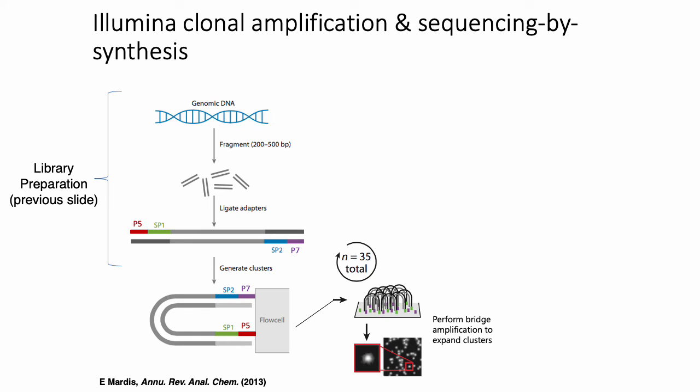And so ultimately the way sequencing happens is that after bridge amplification, you use DNA polymerase to synthesize additional copies of your fragment. And as you're doing this synthesis, you're essentially taking pictures of the bases as they're getting added during synthesis, and in doing so, you're sequencing by imaging. And so you need bridge amplification in order to increase the number of copies of a given fragment at a position in the flow cell in order to generate signal for your pictures.